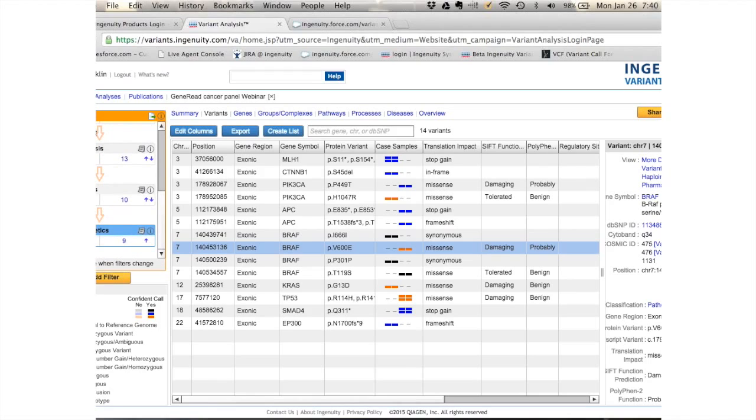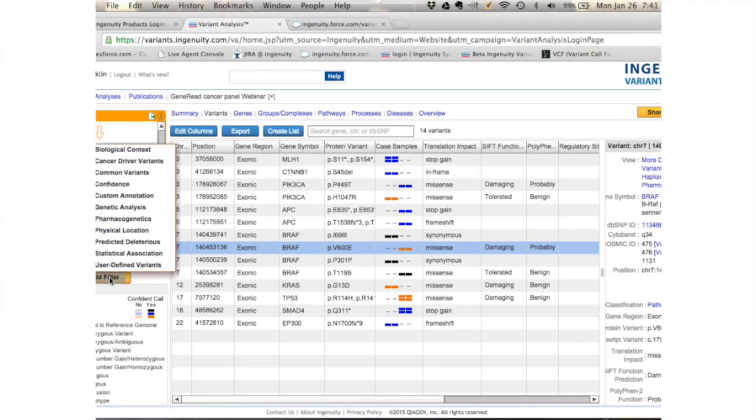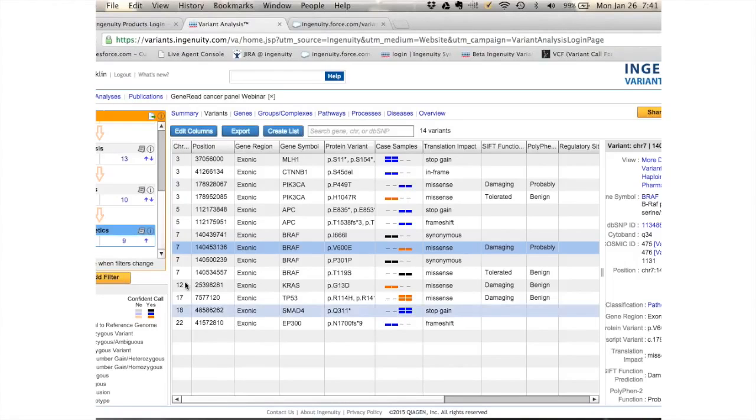And as I said, given the wizard that you will be using, that filtering cascade will be different. You can always add different steps. So here, as we can see, pharmacogenomics or pharmacogenetics information was added. I actually went actively and said, I want to add a filter, and I wanted to focus on a particular drug of interest. So I can select any of the filtering steps and add more filters to tailor my analysis even deeper.